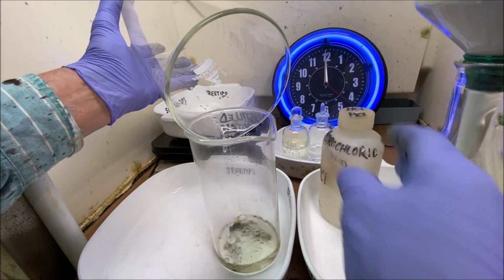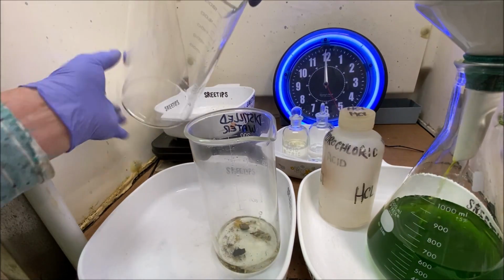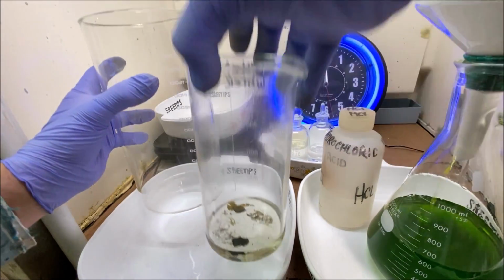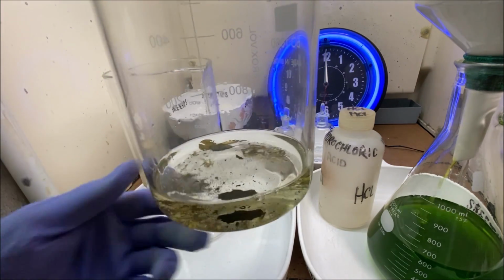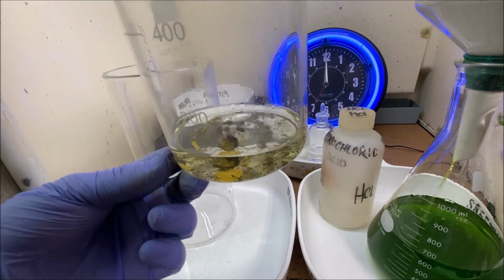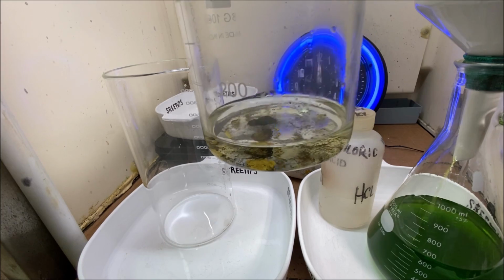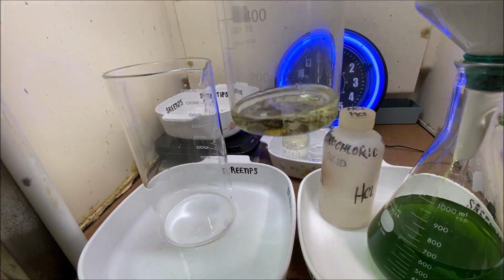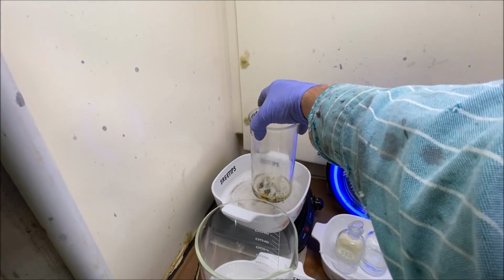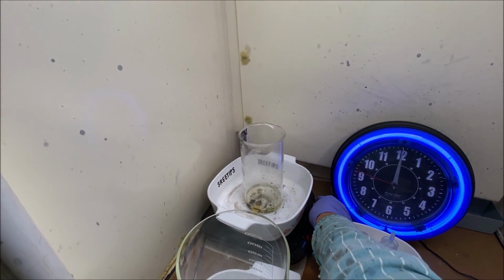Now what we'll do is I can put this back up on the heat. Here's all the material that's down in the bottom of our beaker. It does look like gold. We put this back up on the heat and try to redissolve this now. Why not? Let's go for it. Turn on some heat.